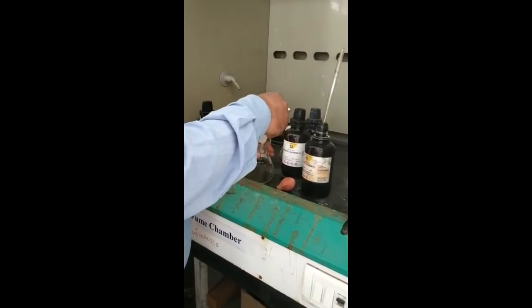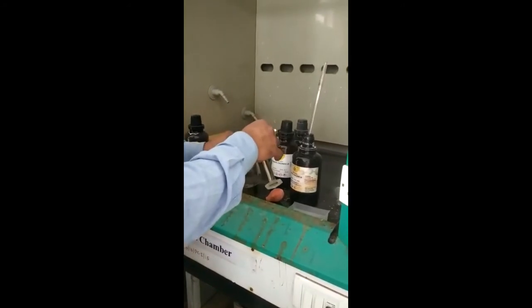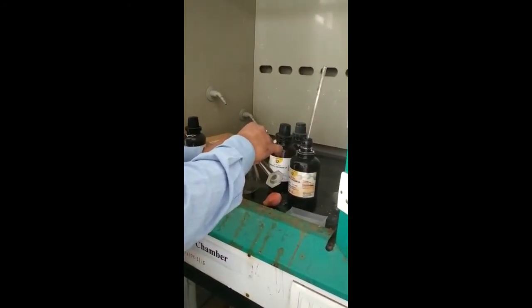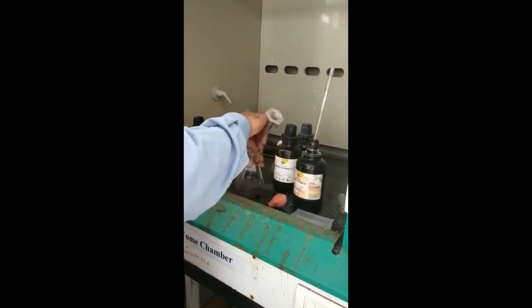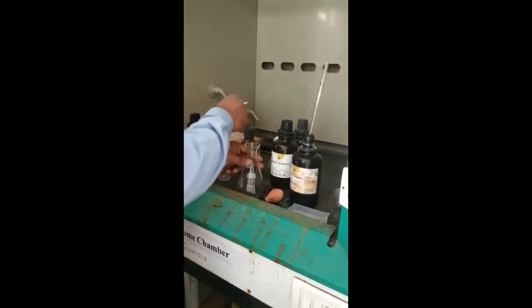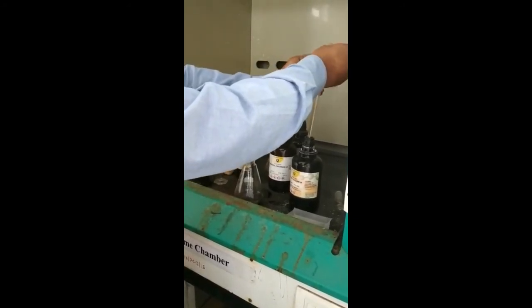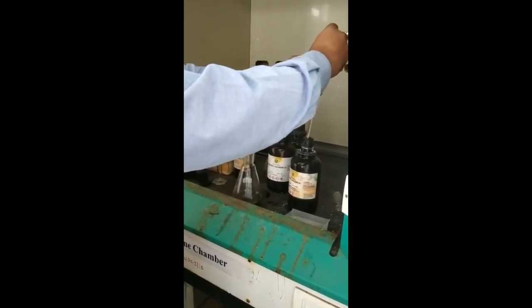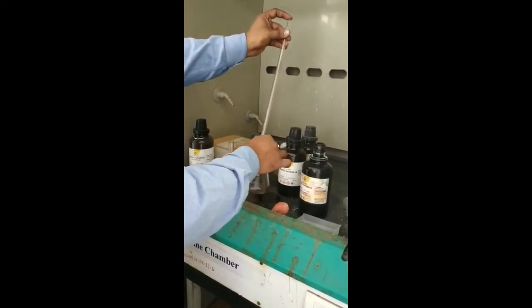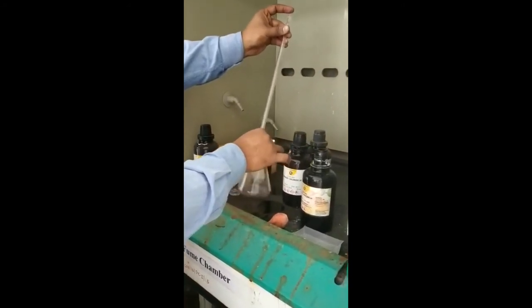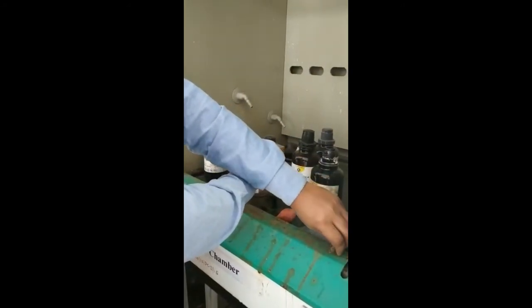Add 0.5 gram of resorcinol as prescribed in the procedure. After taking this resorcinol, we have to add 10 ml of sodium hydroxide solution which is already prepared. And add 1 ml of benzoyl chloride dropwise in fume cupboard. Shake well.